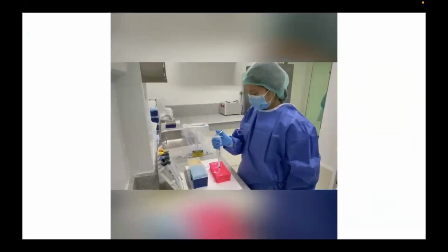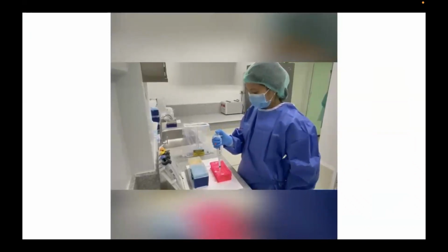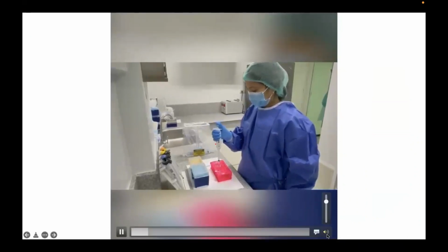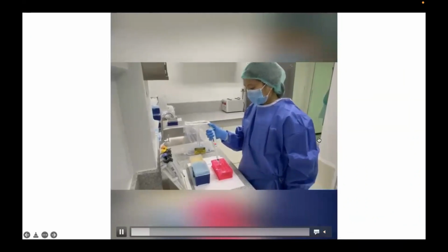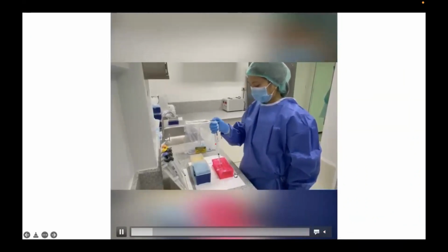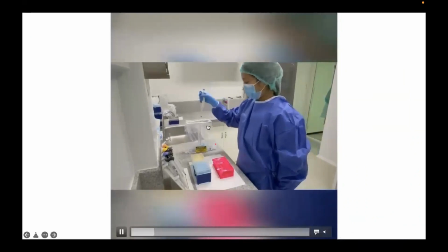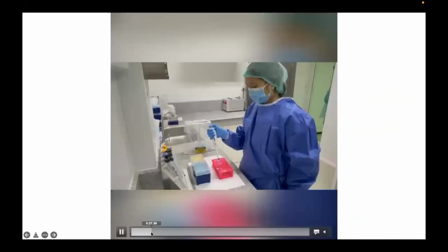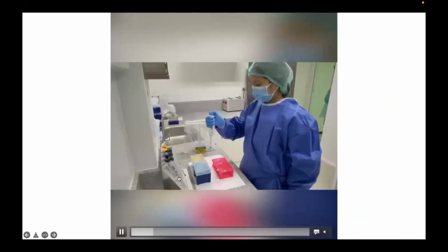First stop, slowly mong i-release. Ayan. And then pag i-dispense mo na, naka 10 to 45 degrees against the vessel wall. And then eject mo na yung iyong pipette tip. So nakita po ninyo, balikan lang natin yon, nasa pipette stand po siya.